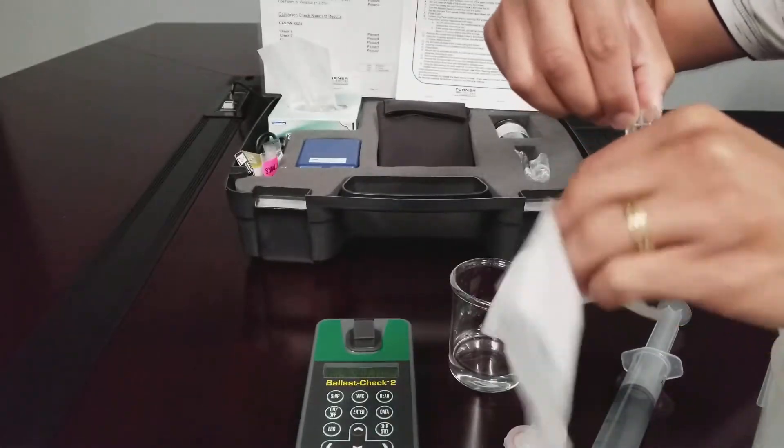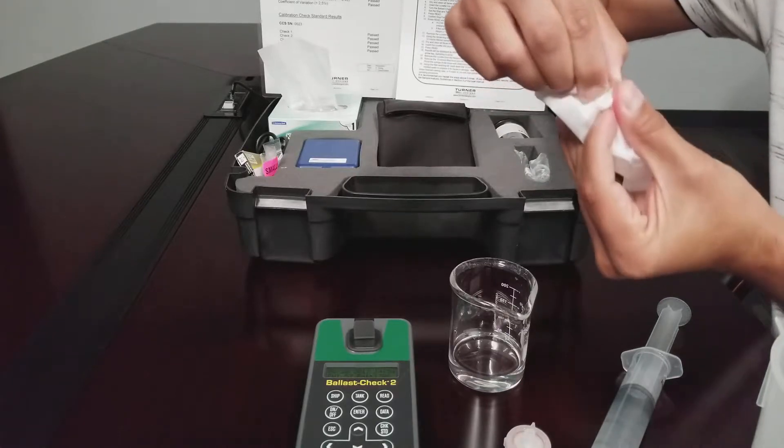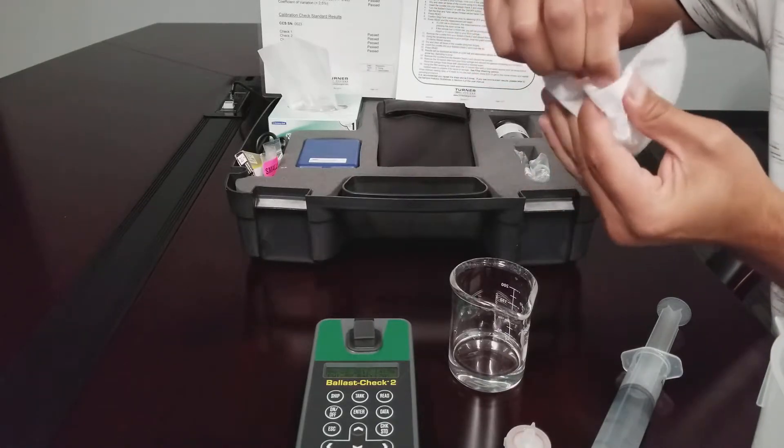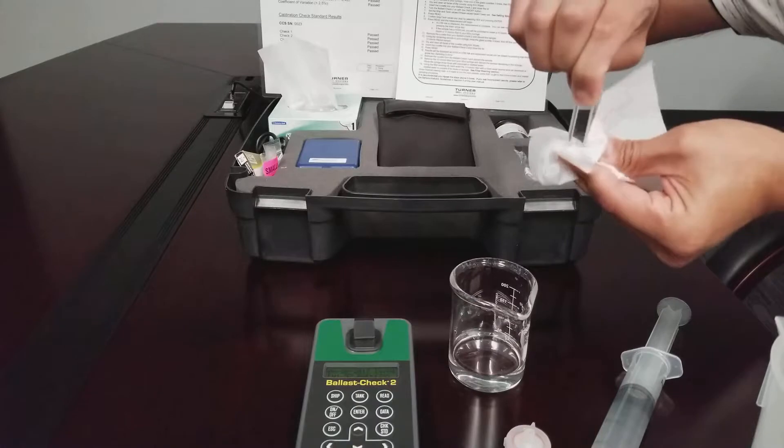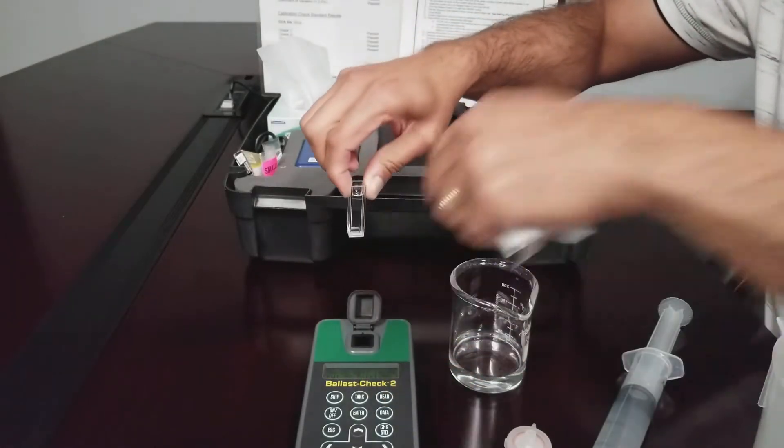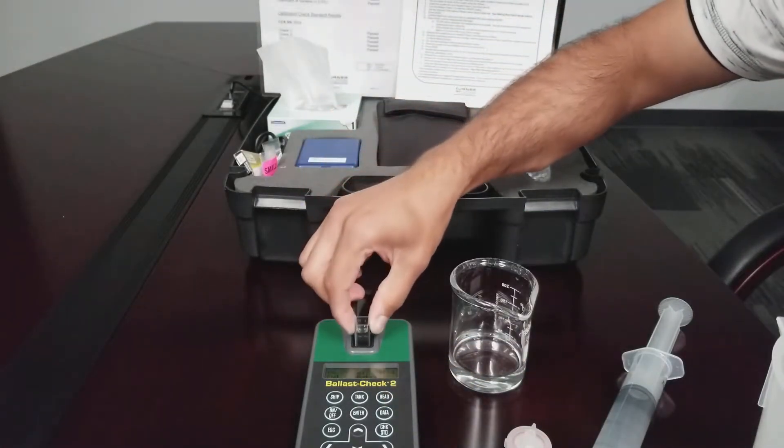Use a Kim Wipe to wipe down the sides of the cuvette to remove any moisture or fingerprints. Insert the cuvette into the sample compartment.